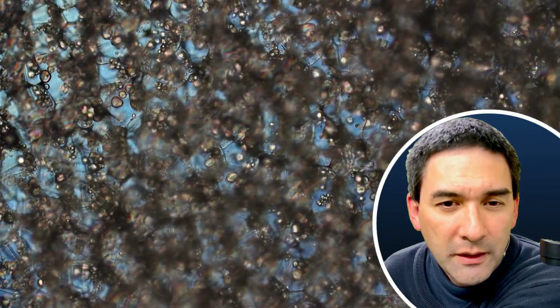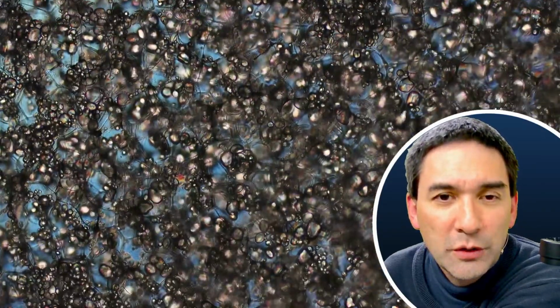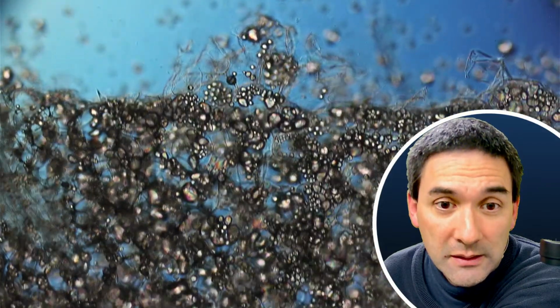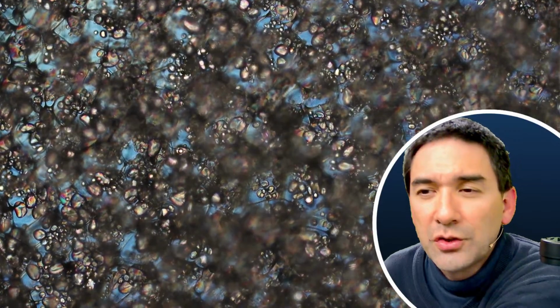Otherwise, if you have concentrated iodine, and my solution unfortunately is very concentrated, it's not good. Apparently it's even strong enough to corrode metals. But I think you get the idea that this also works quite nicely.